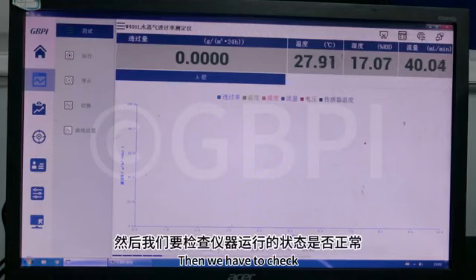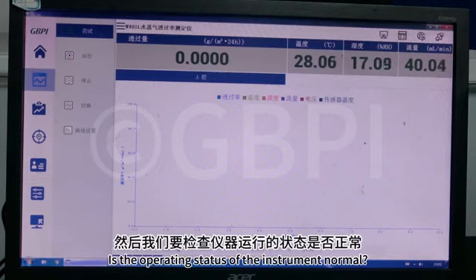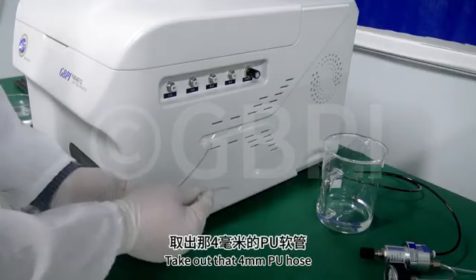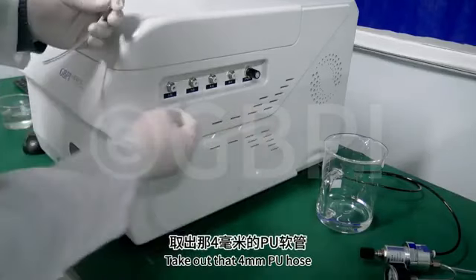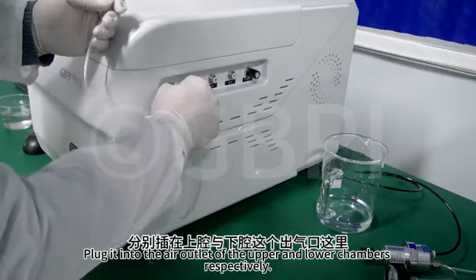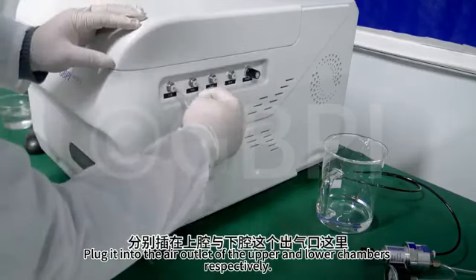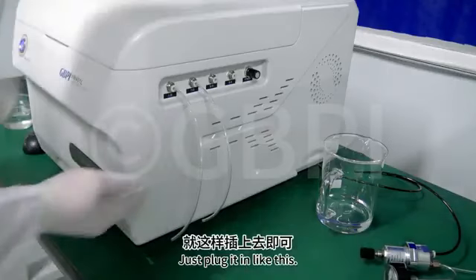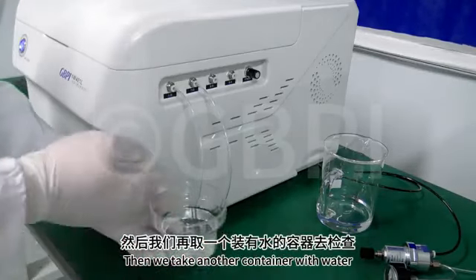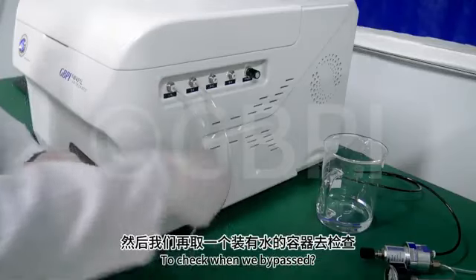Then we have to check: is the operating status of the instrument normal? We get it from the accessory box. Take out that 4mm PU hose. Plug it into the air outlet of the upper and lower chambers respectively. Just plug it in like this. Then we take another container with water to check when we bypass.